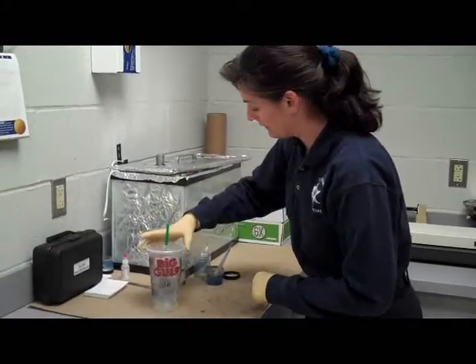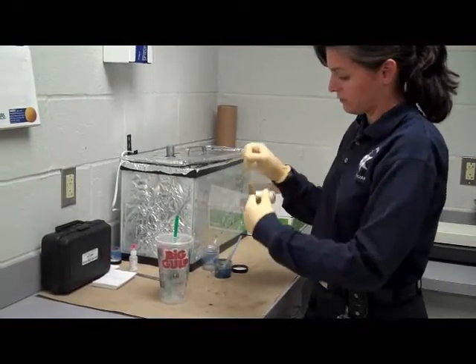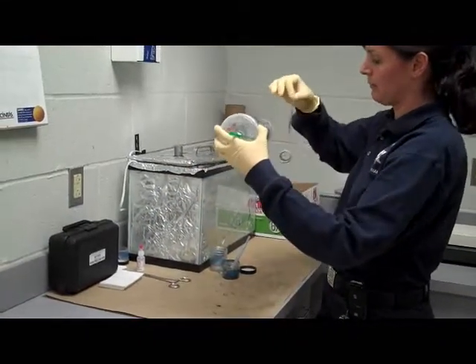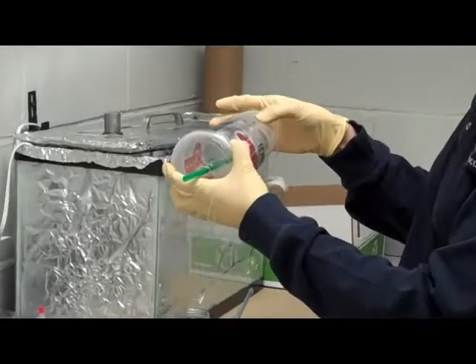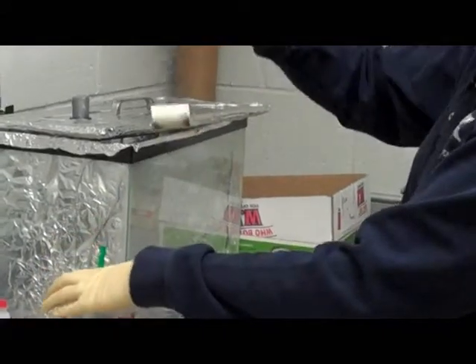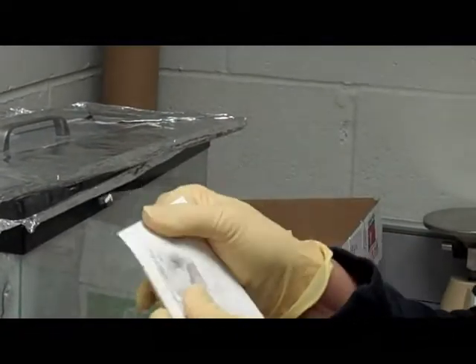Once the prints are visible, you use fingerprint lifting tape. Pull it in a smooth, gentle motion, because you don't want bubbles or anything in your tape. Put the tape right over the print, press it down, making sure you've got all the air bubbles out. Then gently pull the tape off the object and place it right on a backing card. Smooth it down — let the static work for you in drawing the tape to the card so it's all smooth.